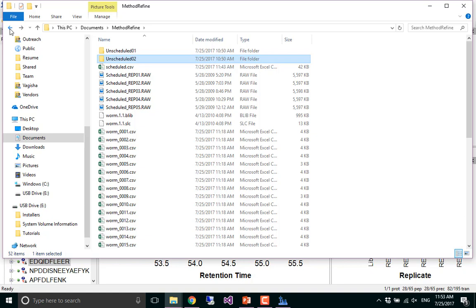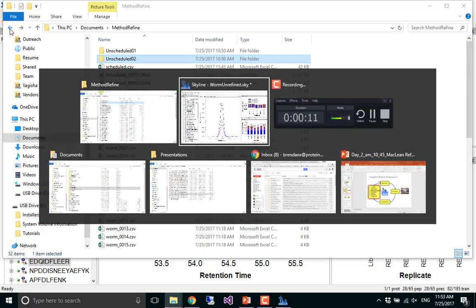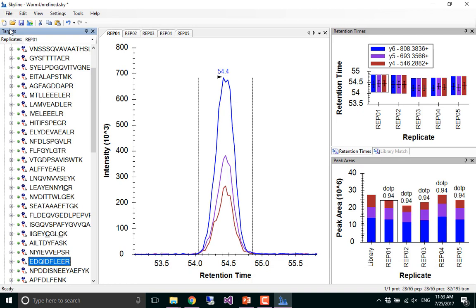taxing. Well, what would you do next? I mean, depending on how quickly we acquired these, if we had acquired these over days, we might have some insight into degradation. But still, what Mike pointed out is that we could at least do an initial differential study, right?